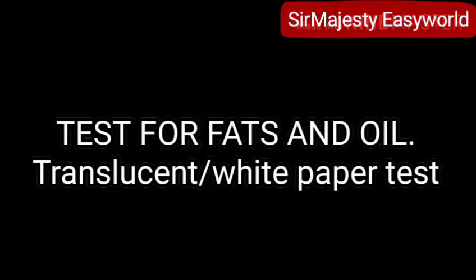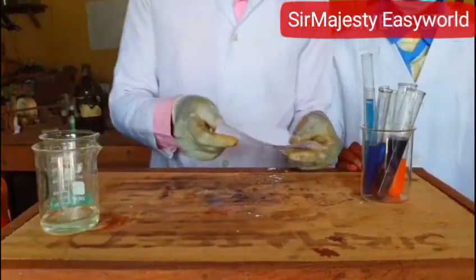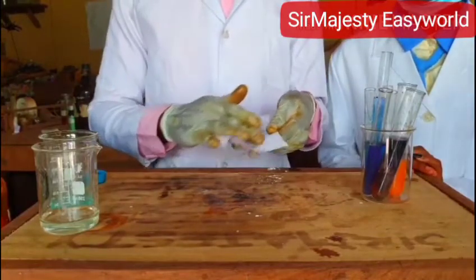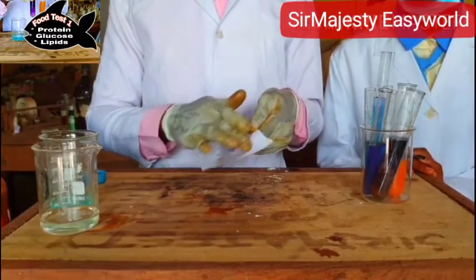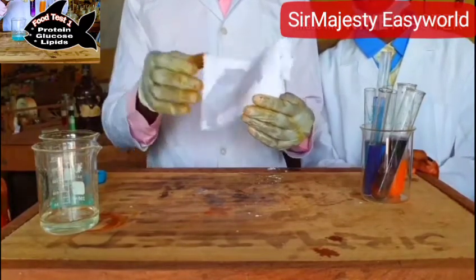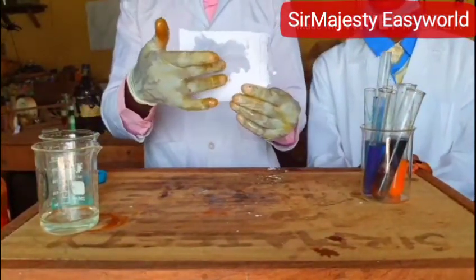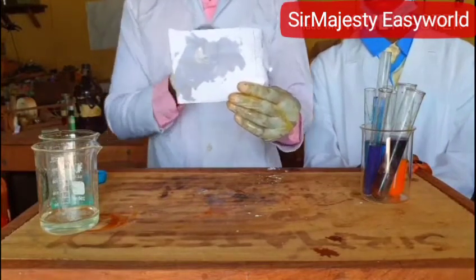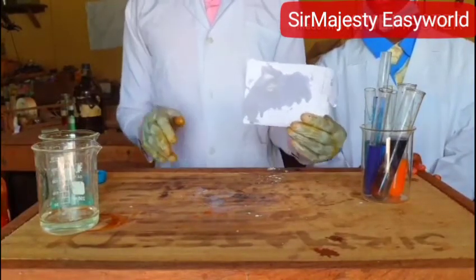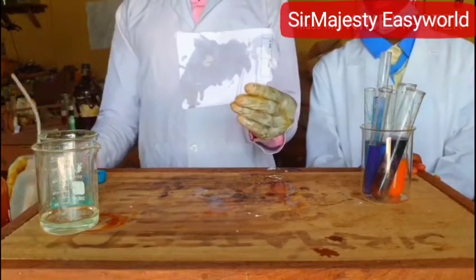It's a white paper test — the translucent grease spot test — that tests for lipids. The procedure is to make a smear of the sample on white paper, then hold it against a source of light. The light will pass through. When light passes but you cannot see through it clearly, it is known as translucent. It is only oil that will do that — anything that makes the paper translucent is an oil. If you drop water, the result is not the same.